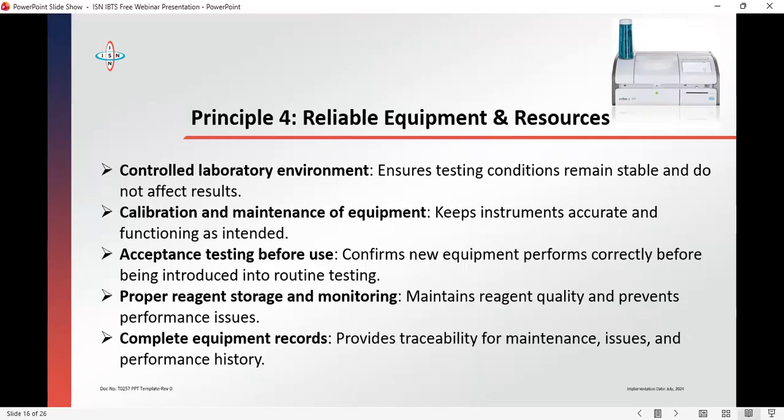There's a requirement that manufacturers have installation qualification submitted. If your lab is going to be accredited by ISO 15189, even if you're not being accredited, you need to have that documentation to guarantee that you are issuing a correct result. You demand it from the manufacturer. Most of it is paid for.